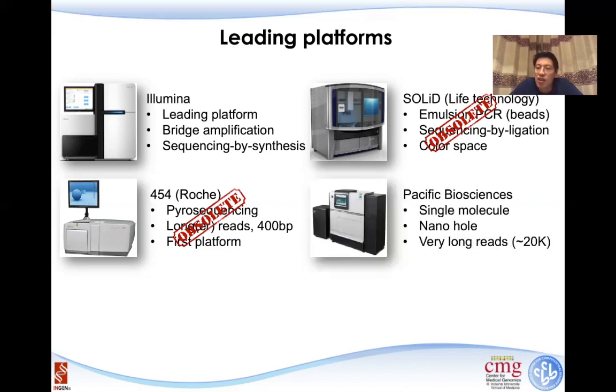The next one is still hanging around, and it's very active, actually. It's a PacBio technology, or Pacific Biosciences. There are several very interesting features about this technology. The first one is it is a single molecule technology, which means that you get a molecule, you sequence it, you don't need to amplify those molecules, which has some advantages during the process. It is a nano-based technology, and the major advantage of this technology is it will create very, very long reads. On average about 20,000 bases, and they can go much, much longer than that.